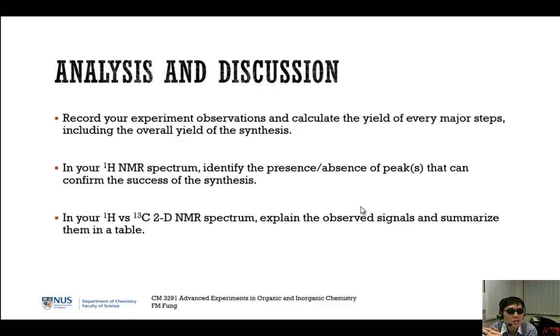Finally, for analysis and discussion, you have to show your experimental observations. I always emphasize that when you're doing any lab, have a logbook and record any small observations, anything you see. Maybe somebody tapped you and called you away for a while. You just record all these little things.